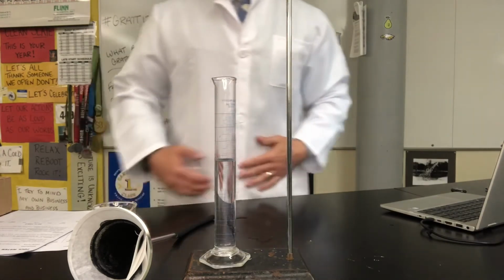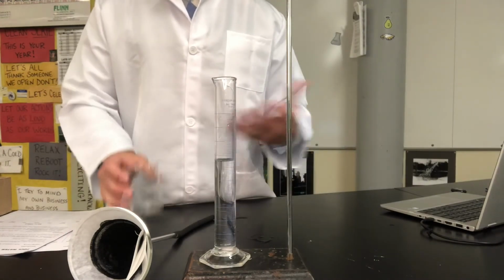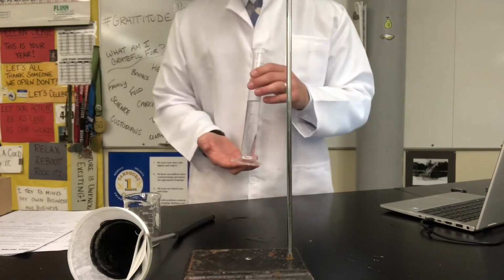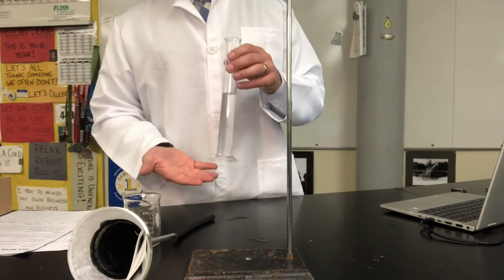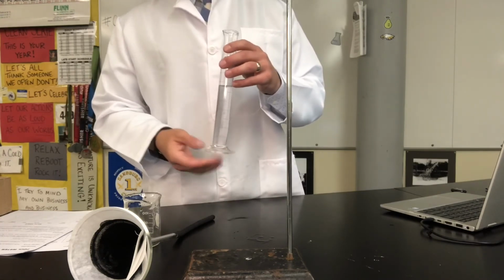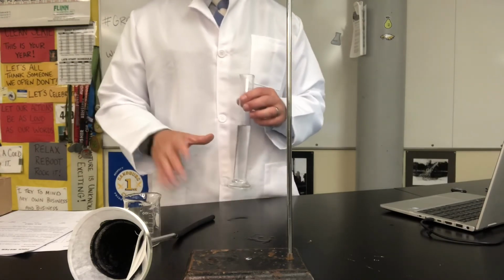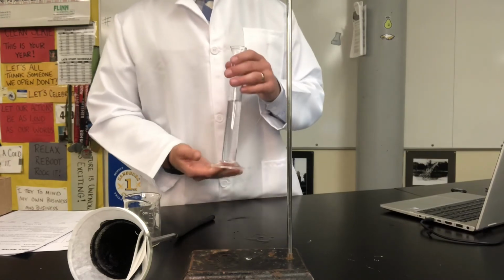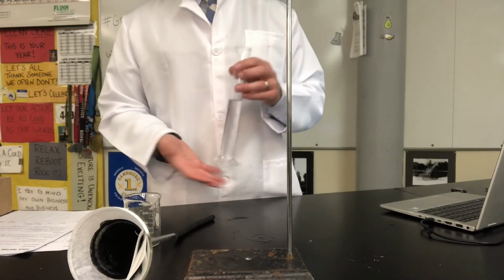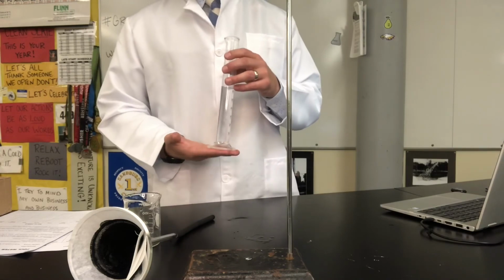Now, a common question is, well, can we drink it? I wouldn't in a lab because of all this different glassware, we never know where this came from. Also, one thing we didn't account for technically is bacteria growth. How old is this water? Is there bacteria? Physical separation can't necessarily separate out the bacteria that could eventually make you sick. So, and always in labs, we're not eating or anything like that. But if you were on a deserted island and somehow had all this stuff, you'd have a lot cleaner water than you started with. I would probably boil it first to try to kill off any germs, but then I'd be pretty confident that it would be pretty clean water.